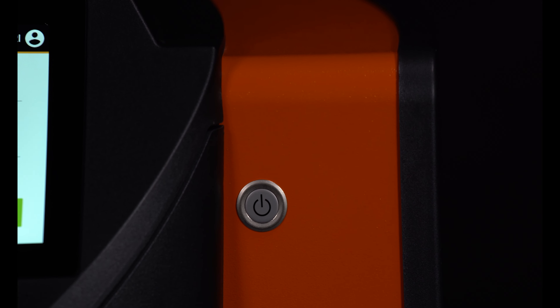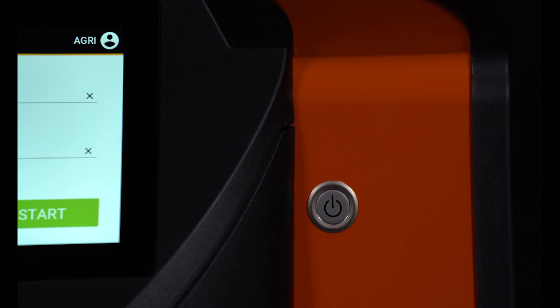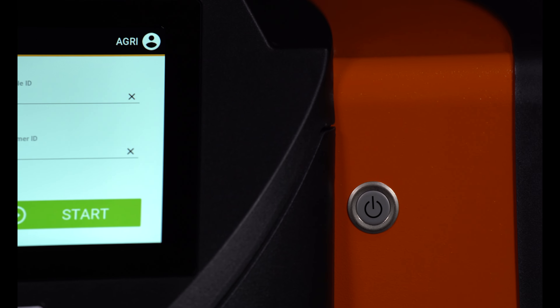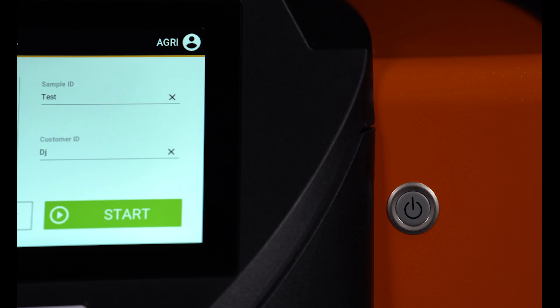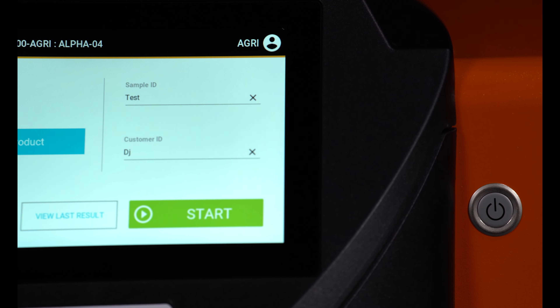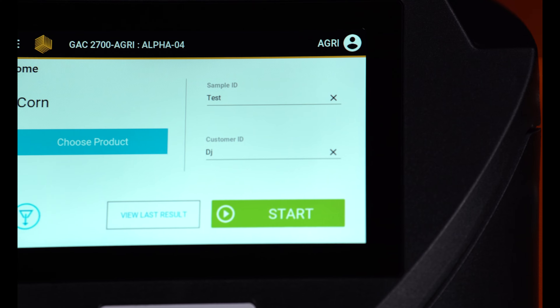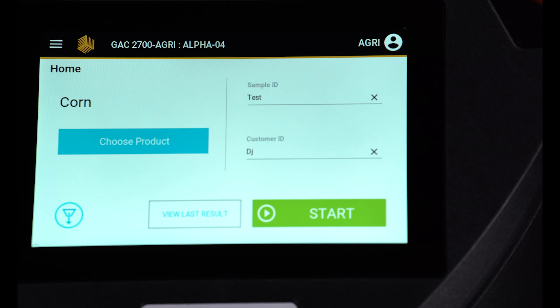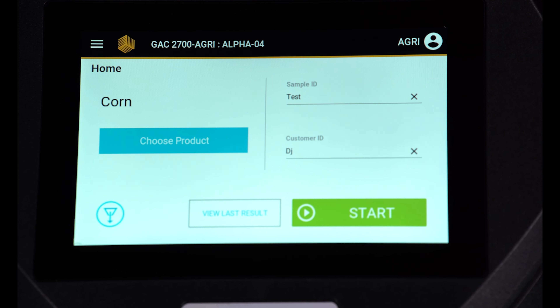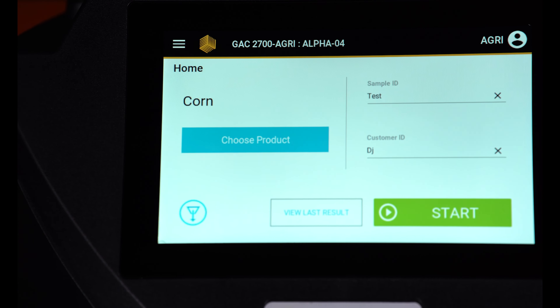This video will demonstrate how easy it is to test grain with our GAC 2700 AGRI grain moisture tester. The GAC 2700 AGRI is ready to begin grain analysis immediately upon power-up.